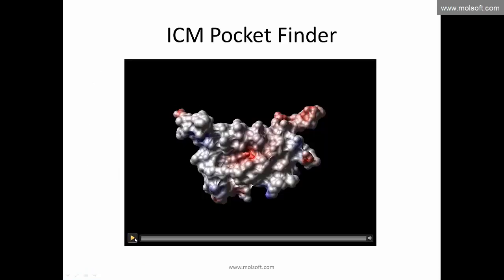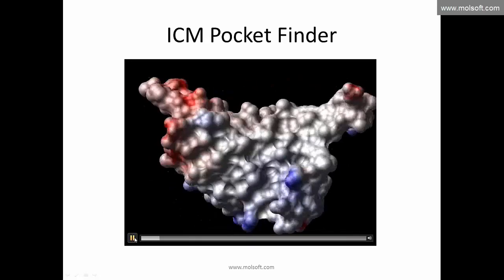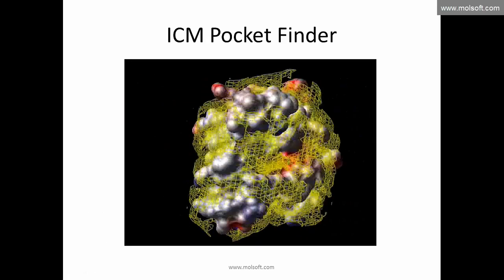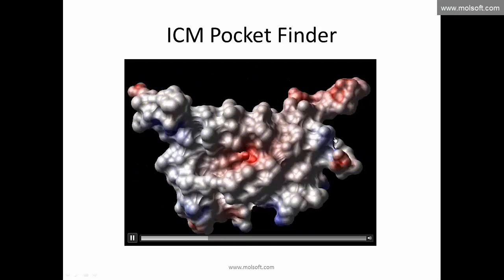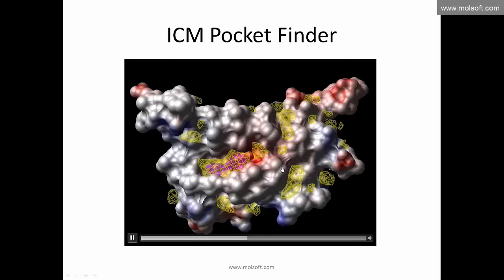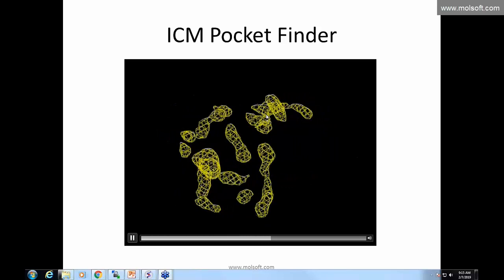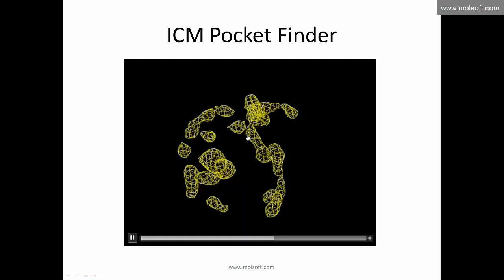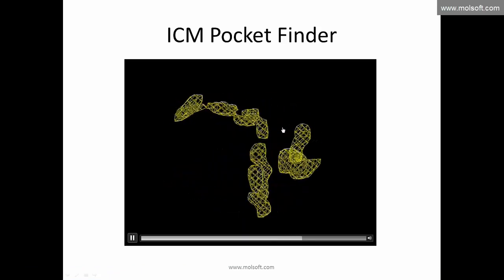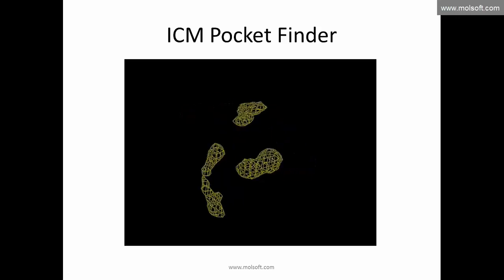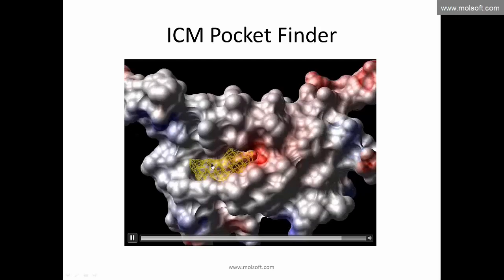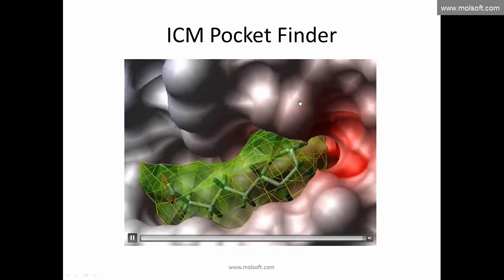Today we're going to download the protein structure from the PDB, use the tools in ICM Pocket Finder to go across the surface of the structure, and identify cavities. Once you've identified the cavities, you need to discriminate ones that are not drug-like — too small, too large, or too exposed — to be a drug-like pocket. Hopefully we'll come down to find the orthosteric site and also other potential ligand binding sites.